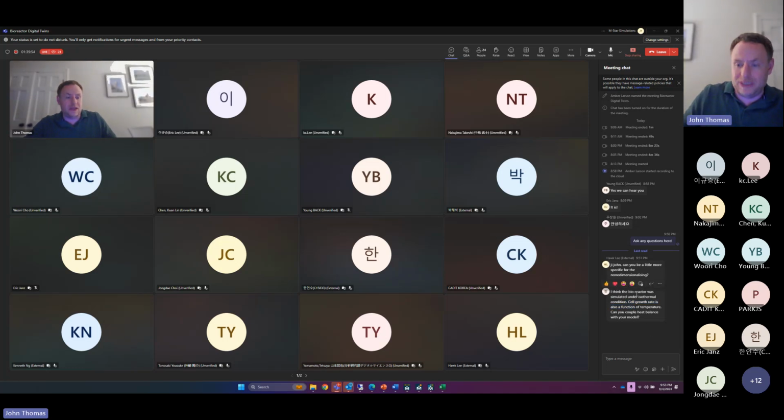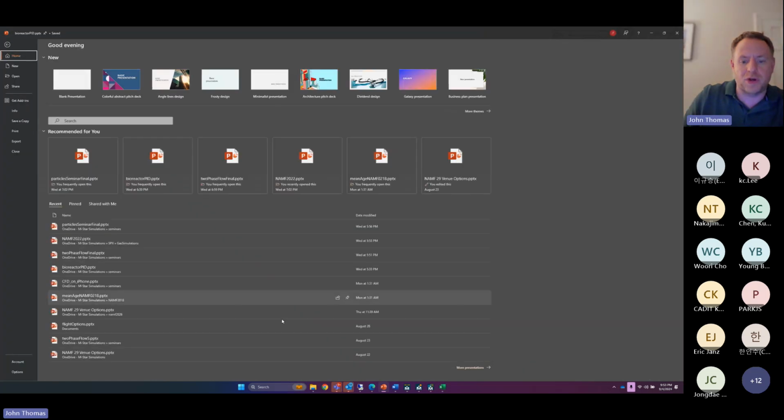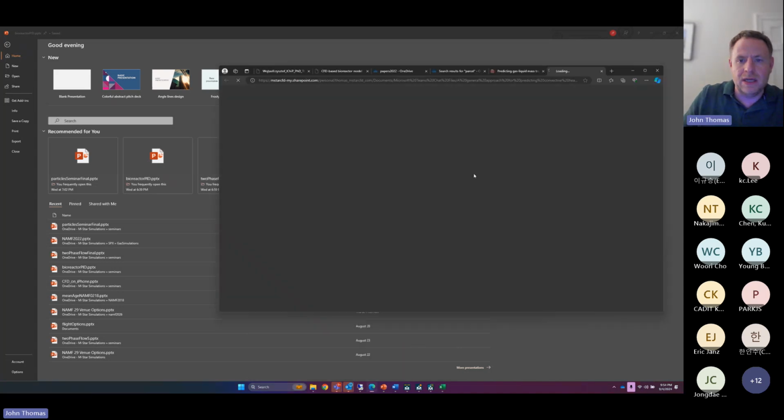Absolutely, you can couple. Yes, great question. You're correct in both regards. Yes, sometimes we have heat transfer in the jacket of the single-use bioreactors, and we can model that in MSTAR. In fact, we have some good literature. I wrote a paper not long ago that spoke about the heat transfer physics.